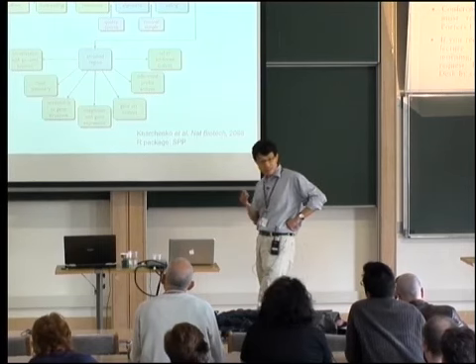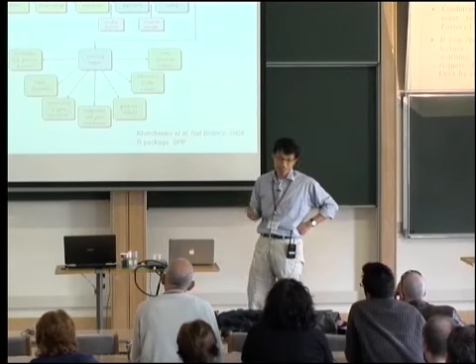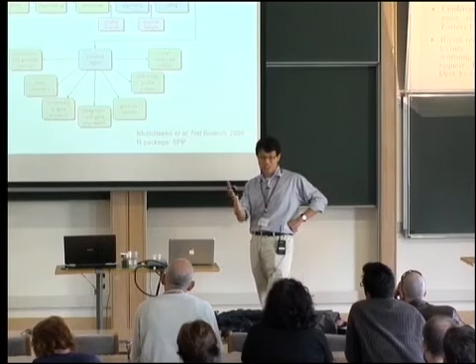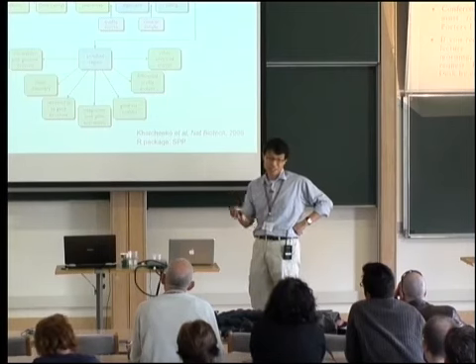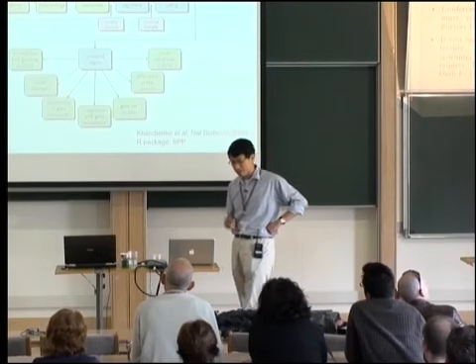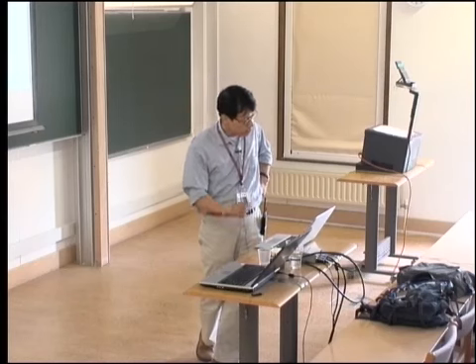And in practice, how many reads do people get? So it varies from 3 to, nowadays, 10, 15 million, and it varies not for scientific reasons, but because of how much one lane of an Illumina machine generates. So if you look at data sets from 5 years ago, probably, or 3 or 4 years ago, it was 3 lanes, or 3 million reads, and now you have more. Okay.